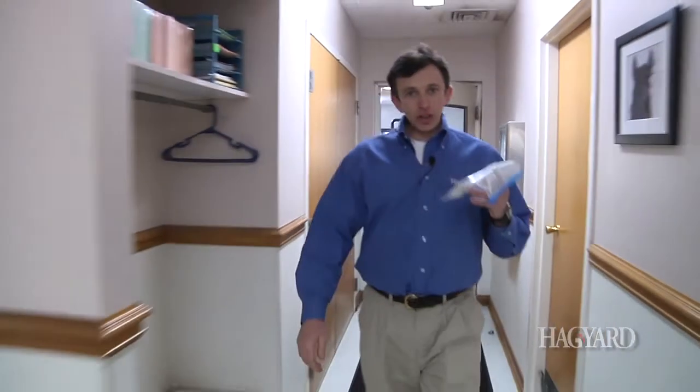So now that we have the environmental sample from one of our stalls in the barn, we're going to take it to the laboratory where Tina can end up processing it to something that's useful.